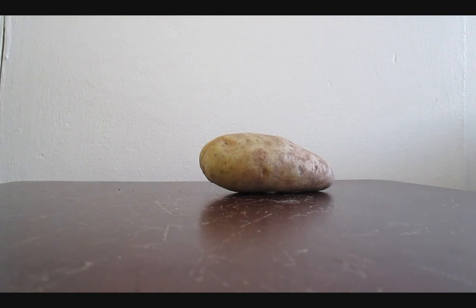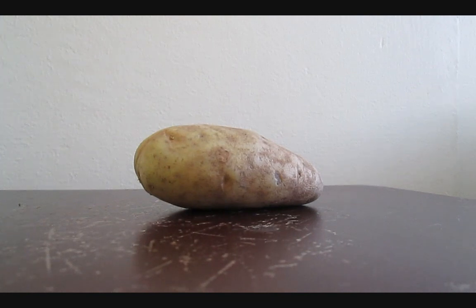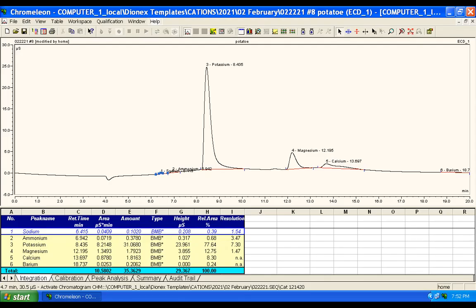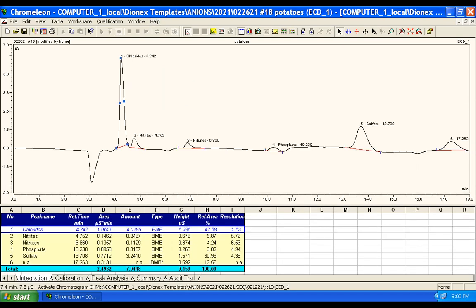I was expecting a legume growing on the ground to reflect the dirt concentration of minerals with a lot of sodium and a few heavy metals. But no — potatoes appear to be selective and, much like many other flora, concentrate potassium and, intriguingly, barium as well. Anions are having a field day too: chloride, nitrate, nitrite, phosphate, and sulfates are all present along with some organic salts I am not able to identify.